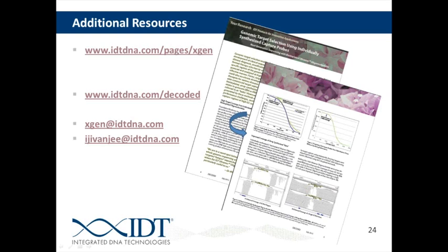In comparison, if you're using the NCBI databases, and particularly the RefSeq databases, there's a very nice versioning system that allows you to see what version you're on and make sure that you're comparing the current version to the current version. That doesn't exist in the genome browser, to my knowledge. So I think NCBI and Ensemble are the two most up-to-date databases that there are currently.